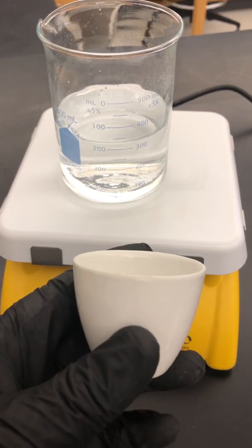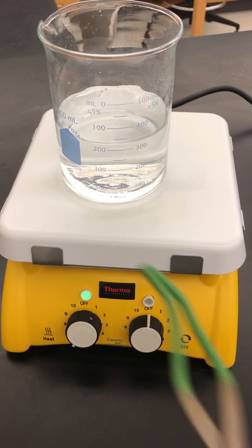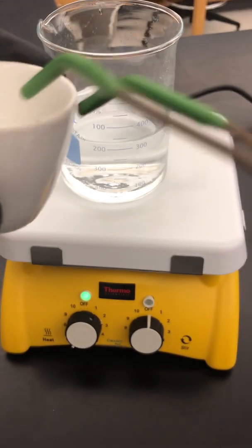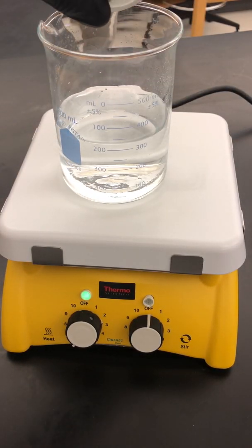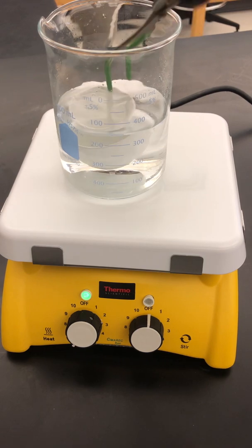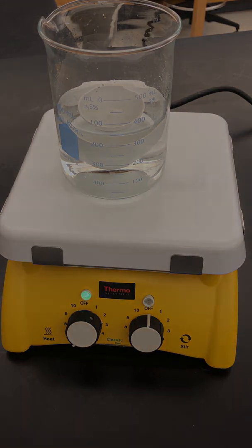When you finish, scrape off as much of the solid into the waste container as you can. Then place the crucible into a beaker of water that has been heated to near boiling with a little hydrochloric acid added — gently drop it in and let it soak for a few minutes. When done, pull it out, rinse it in the sink, and return it to the stock room.